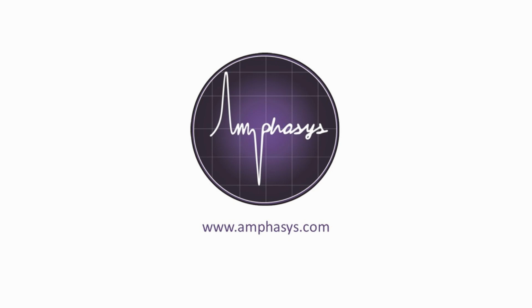Welcome to today's video on how to do basic data analysis with the AmphaSoft 2.0 impedance flow cytometry software. In a previous video, we learned how to measure a sample, so now we want to have a look at how to work with the acquired data. To do that, I prepared some samples to show you the possibilities of AmphaSoft.